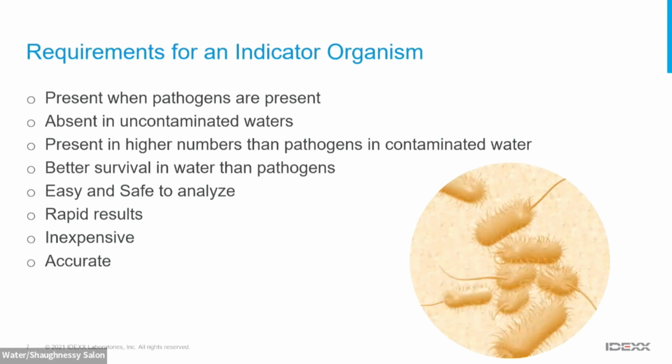So after that very general introduction to how bacteria work, now talking about when we actually are looking for bacteria, why we're looking for them and what we're looking for. When we're testing water, whether it be drinking water, wastewater, recreational waters, source waters, what we're looking for is something that's going to tell us whether or not the water is safe.